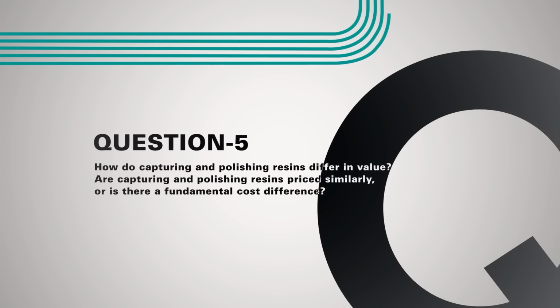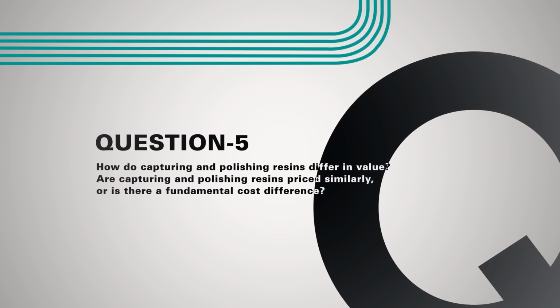Interesting. Okay. So now I'm going to put my business hat on, right? Because obviously I work in sales. So can you explain to me the value of a resin used for capturing versus polishing? Are they similarly priced? Or are they similarly resourced? Like, what's the actual fundamental differences between the resins used in these steps?